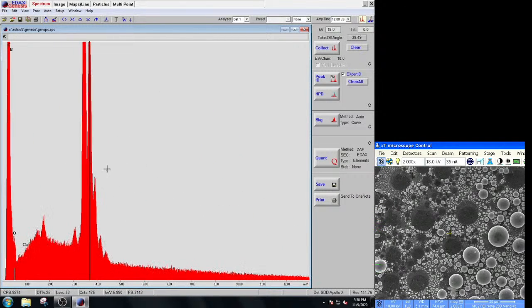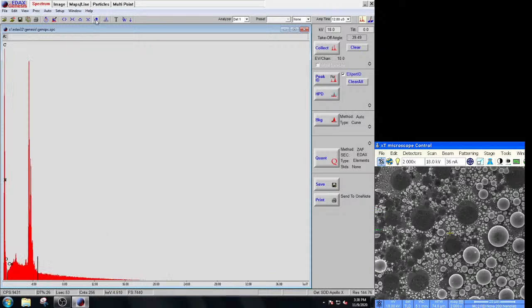If your display gets really messed up, if you go up here to the top, there's this little house icon, this home icon. This resets your display back to the standard starting point. So if you get really, really messed up, I would say go for that.